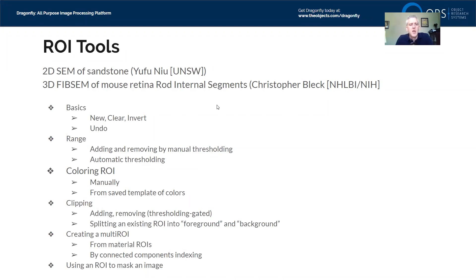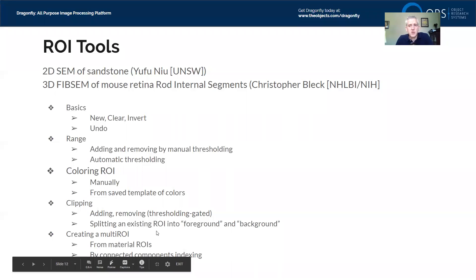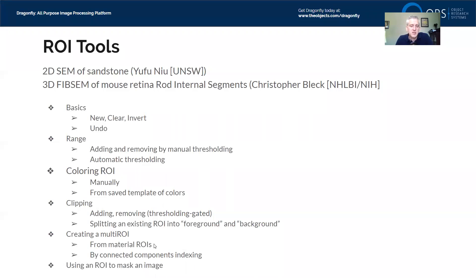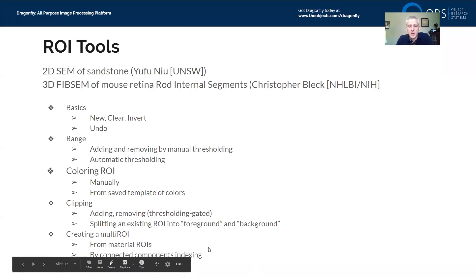The agenda for today: we'll look at basic ROI tools like how to create a new ROI, how to clear it, invert, and undo certain operations — almost any operation on an ROI can be undone as the single last operation. We'll also look at the range or thresholding tool for adding and removing by manual or automatic thresholding, how to color your ROIs manually or from a template, clipping operations using a 3D clip box, splitting an existing ROI into foreground and background, creating a multi-ROI from ROIs based on materials, and labeling individual grains or pores using connected components indexing.